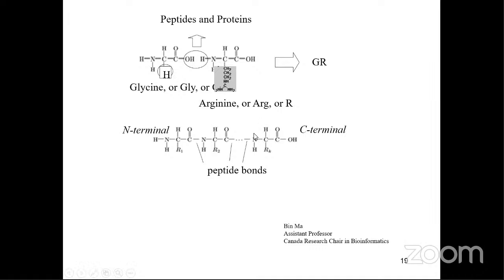Generally the peptide bonds are the weakest. So in a mass spectrometer, the peptide bonds break. So if you have a long protein, the peptide bonds will break one after another and after another. So you will get mass corresponding to these fragments. So that's how we try to identify the amino acid sequence. So the peptide bonds are the easiest to break. And of course, amine bonds also can break. That is a CN bond. But generally, the peptide bonds break easily, actually.